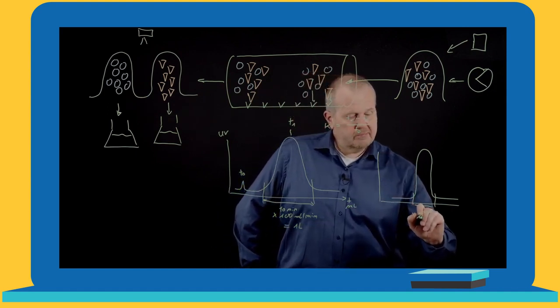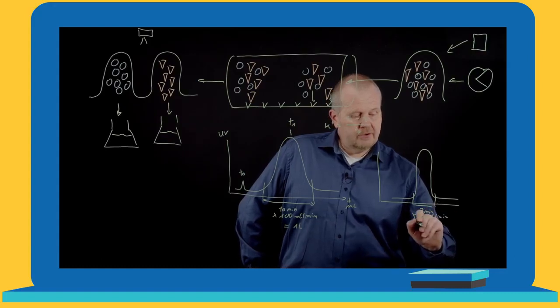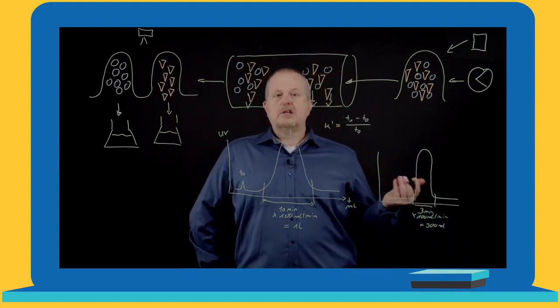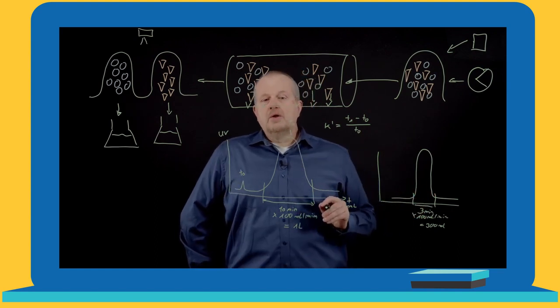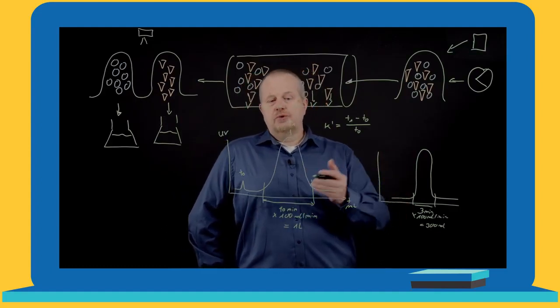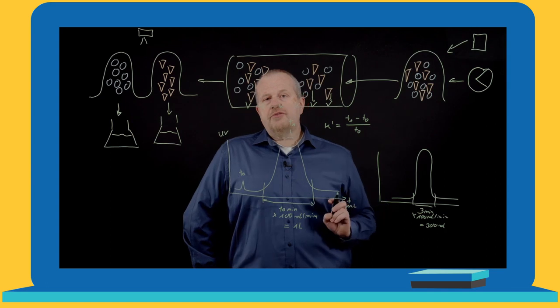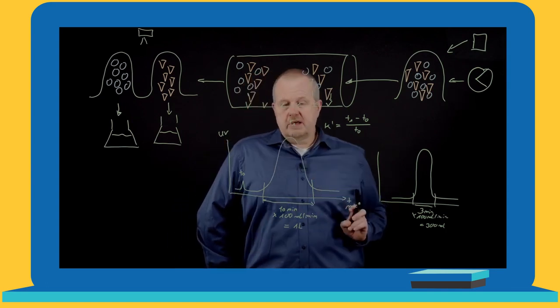Again, 100 milliliters per minute of flow rate gives only 300 milliliters of fraction volume. If you do that with very large columns and you have a threefold difference in the volume collected, you can imagine how important it is to have small peaks and very concentrated fractions.